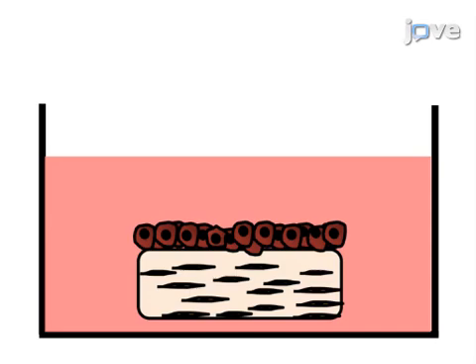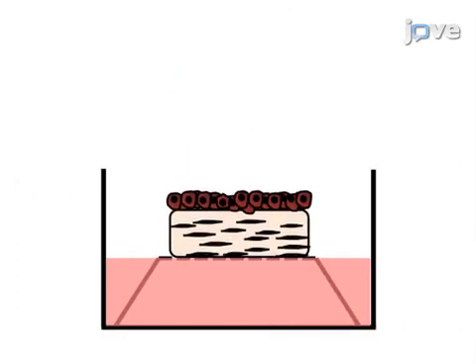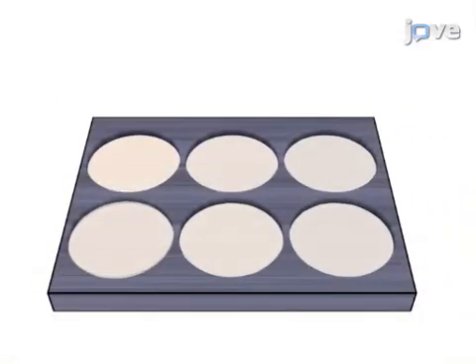The final step is to perform the air-liquid interface culture and invasion assay through exposure of the contracted gels to air by placing them on a mesh situated in a six-well plate.